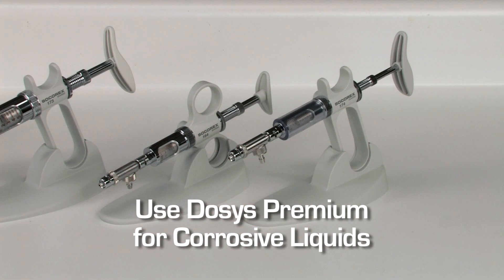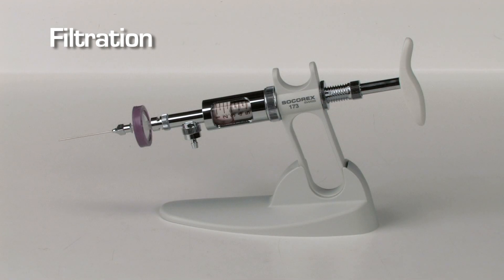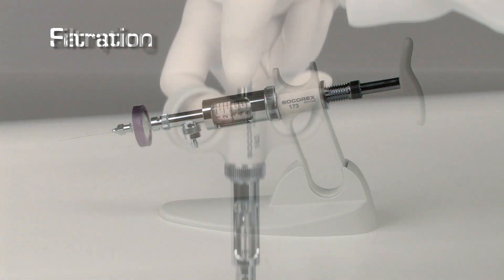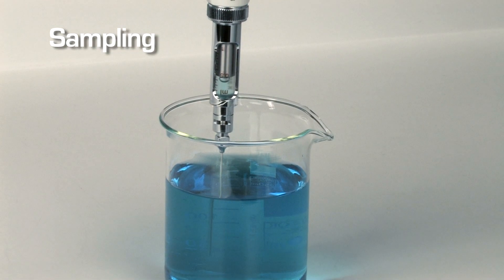When dispensing corrosive liquids such as acid or base solutions, the Dosus Premium model is recommended. A Luer Lock nozzle accommodates a standard syringe filter. The Dosus Basic, without a valve, is perfect for sampling any liquid.